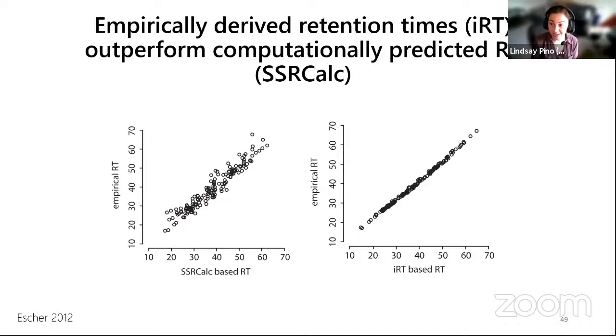I allude to manually curating peptides. It seems reasonable in PRM when there's maybe 100 peptides, but wouldn't we let the software do this with DIA? Absolutely agree. That's exactly what I do, Leanne. I will process all of my data all the way through statistical testing, and then anything that's significant statistically, which tends to be closer to like the 100 peptide limit for manual curation, I'll go back and double check those chromatograms just to make sure that it's real signal.